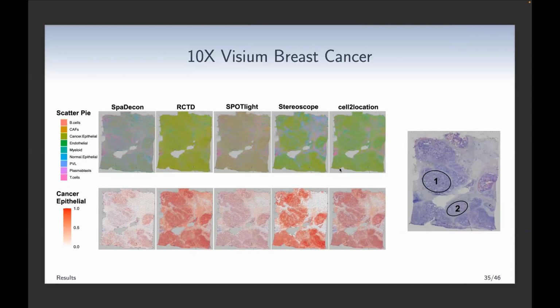Yep. I think that's very interesting. I think you basically use some histology data also to have the annotation here. I'm just wondering, when you analyze data using different software here, do you use the same single cell RNA-seq reference data also? Yep, the same single cell reference data is used, and the same pre-processing steps are used. The only difference is that we do the local smoothing of our SRT gene expression matrix, which the other methods do not. Yeah. I see. Great. Thank you. Yep, no problem.